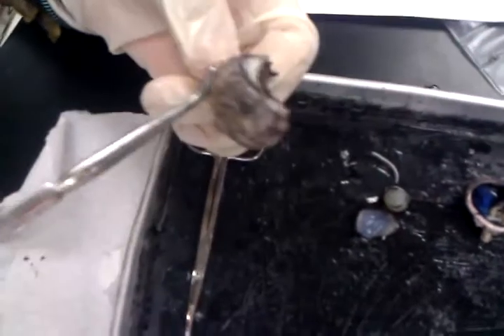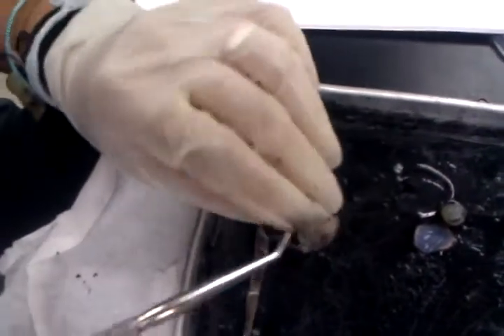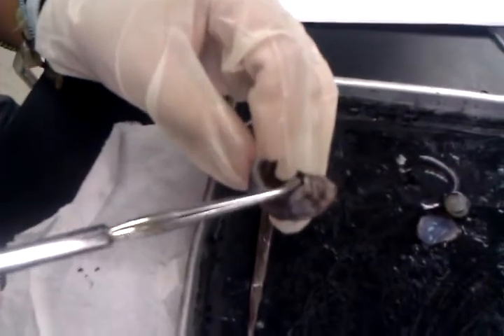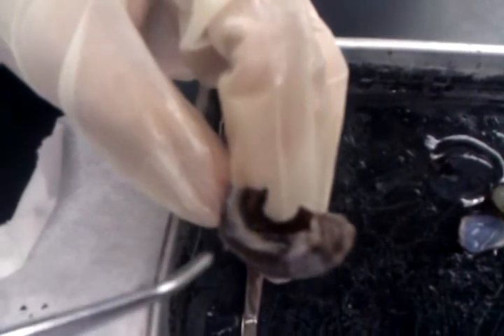The sclera is this part right here, which should be white. And this is the iris. The hole is the pupil. So this is like, this is half of an eyeball.